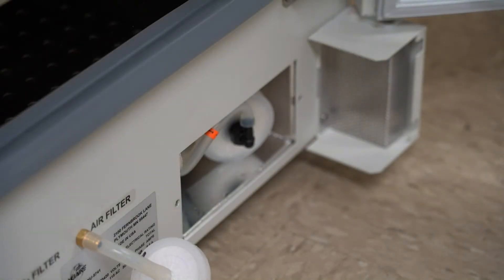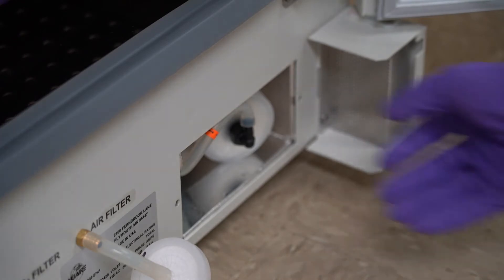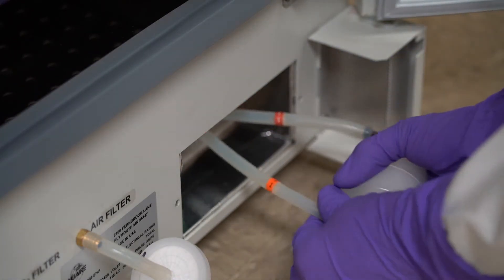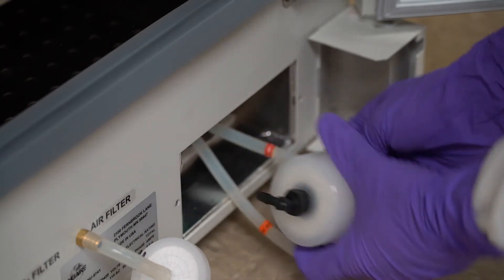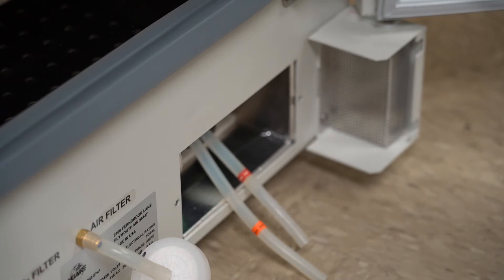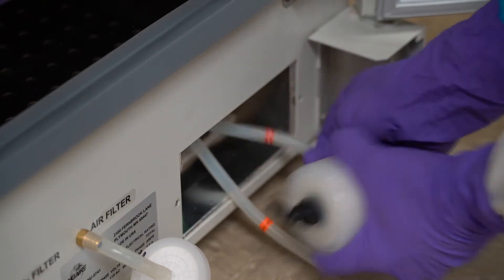Pull out the capsule HEPA filter and inspect it for discoloration that indicates it should be replaced. If necessary, remove the old filter from the tubing and connect it to a new one. Be sure to install the new filter with the correct orientation.